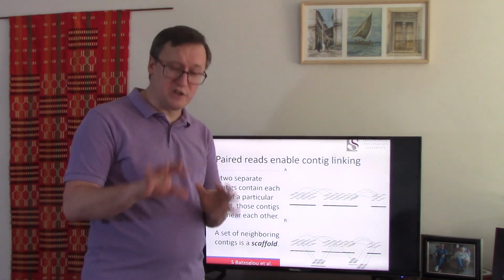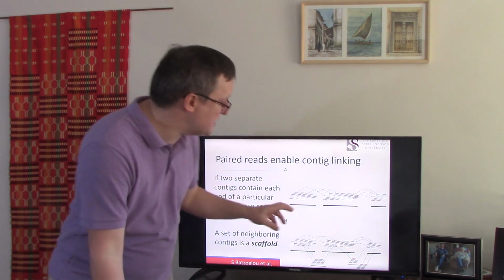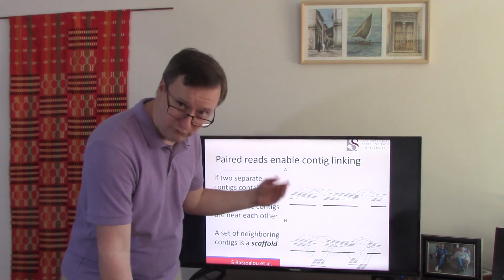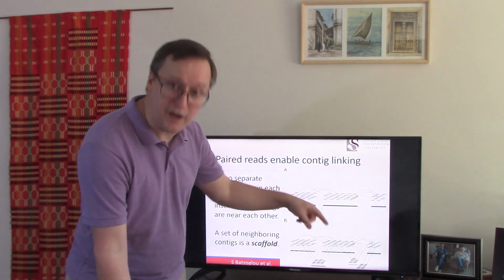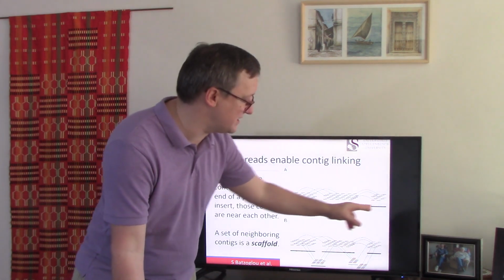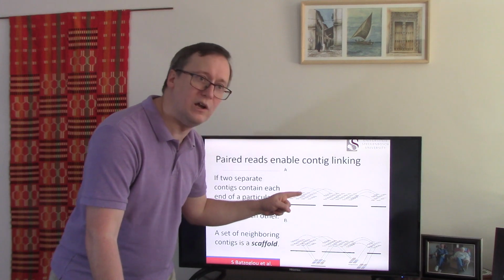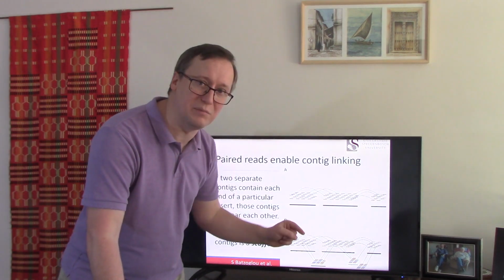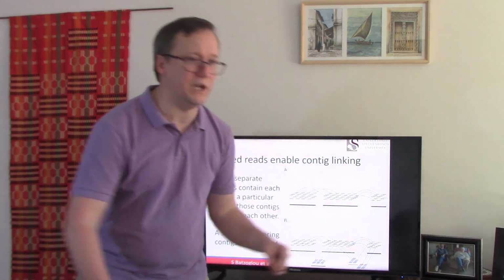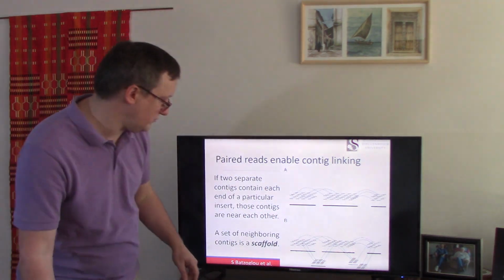All right, so to return to this question of how we determine which contigs belong together in a common scaffold means that we need to be able to recognize that this contig has a whole bunch of pieces of DNA in it, a whole bunch of reads in it, that are associated with reads on the other end of those pieces of DNA that exist in another contig. You can see in this case that contigs A, B, and C are all able to be put in order because the pieces of DNA that appear with reads in A also have reads in B. The pieces of DNA that have reads in B also have reads in C. Therefore, we know that these three belong next to each other in the same reading, in the same coding strand, in the same sense.